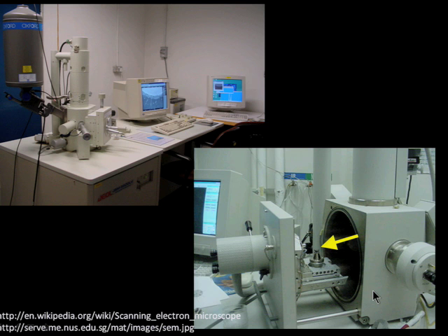There are variations on this that let you, for example, use a little bit of moisture or seal your sample in very, very small, you could say, little boxes. But by and large, what you put in an electron microscope has to be vacuum compatible, so it can't be wet and so on. And also the sample has to be electrically conductive, because that electron beam that scans across the sample is going to charge your sample, and you need to have a means of dissipating that charge to maintain a stable imaging condition.